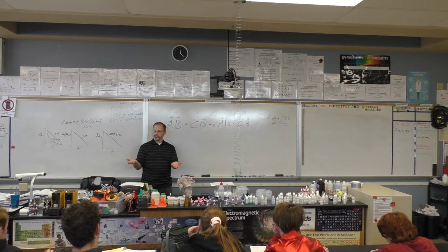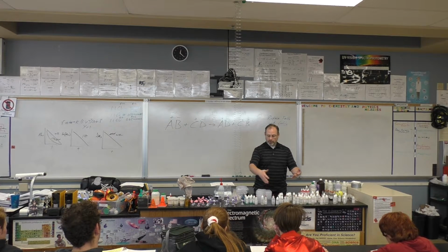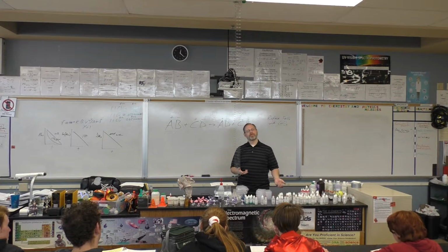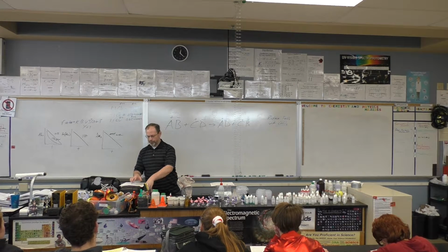Make sense so far? Now, everything that you're going to be using today is aqueous. All of these are aqueous. But we're going to put them together and we're going to make precipitates. What's a precipitate? Falls out of the solution. Simply falls out of solution.